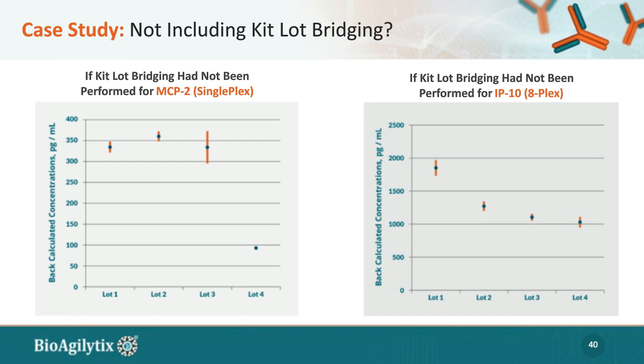And if we were looking for increasing signal due to your treatment, you would be scratching your head saying, I don't understand, or you would be blaming your biological lab or the CRO saying, wait a minute, what's going on here? I'm here to tell you that this has nothing to do with your drug. This has to do purely with lot-to-lot variability. And if you do not keep close eyes on the lot-to-lot variability and have some kind of a mechanism to bridge those lots together, you will end up with data that can be very confusing.